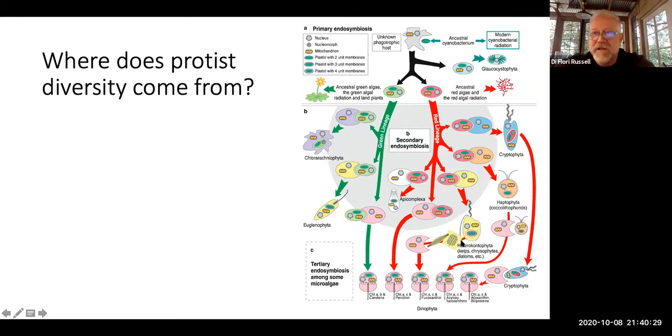If you follow this one back, you'll note that there's a place where there are things like diatoms, which is one of the phyla you will undoubtedly see, Bacillariophyta, and then they get taken in by another flagellate group, which then becomes the main organism, with the diatoms becoming the little organelles within. So it's really crazy to think about these lineages and this evolutionary process. You're really getting to see the results of a really amazing evolutionary process in looking at protists.